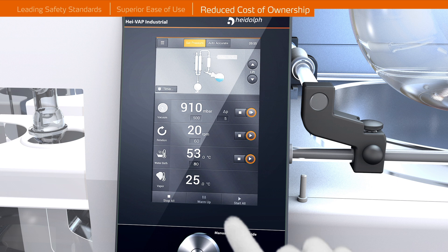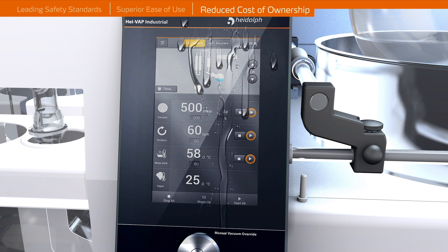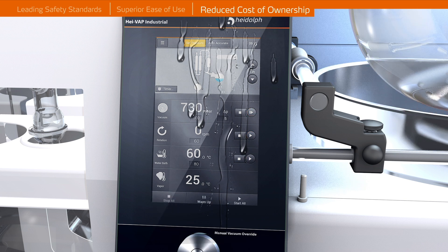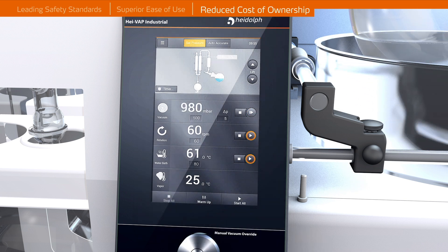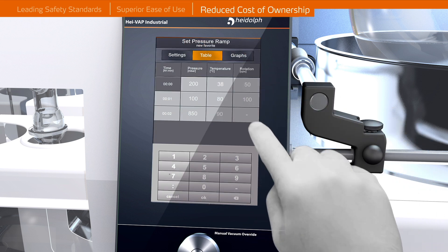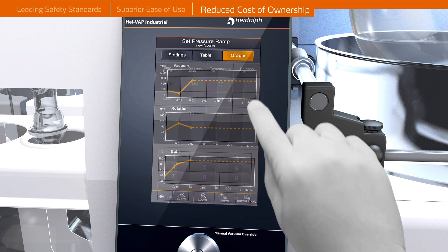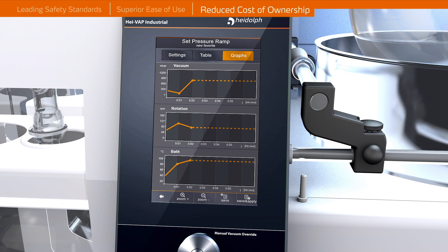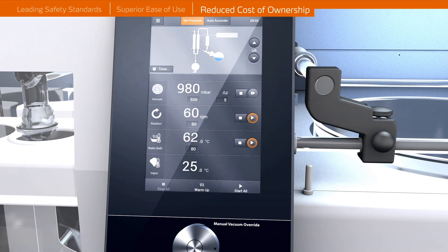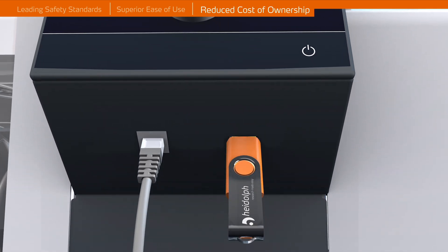Reduced Cost of Ownership. A touch screen panel provides intuitive operation while the glass layer on the panel protects the internal electronics against liquids and corrosion. The unique user interface offers intuitive features like a preheating option for the heating bath to ensure an efficient workflow. Productivity increases can be achieved by utilizing integrated automatic distillation programs and ramping functions. Instant software updates and process documentation are enabled through USB and LAN interfaces.